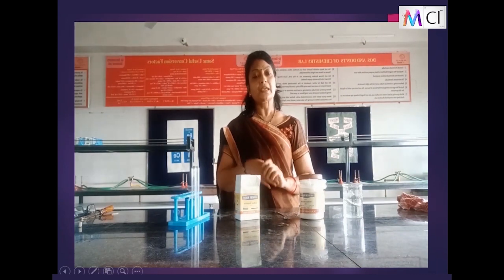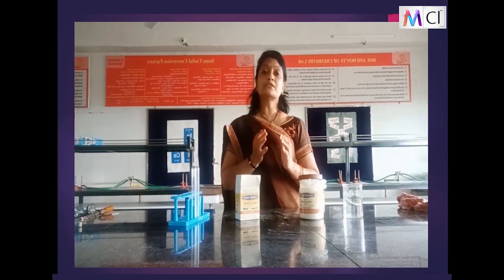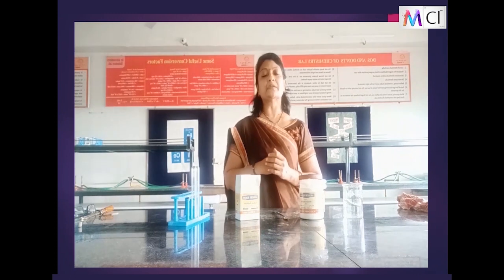Our next reaction, children, is the double displacement reaction. Let us take an example over here for the double displacement with sodium sulfate and barium chloride. Children, as we have learned in double displacement reactions, there is exchange of ions taking place between them, and we observe a precipitate which is formed in this kind of reaction. So it is also termed as a precipitation reaction.